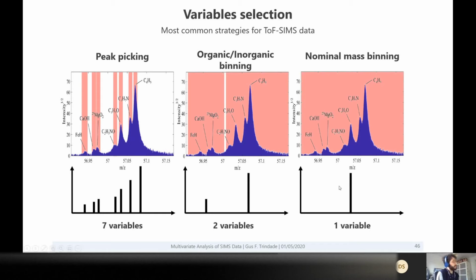So that's the danger. You have to consider sometimes, it's a simple system, and for unit mass, you only have a single peak. So you can do this. It's just a matter of knowing your data. And these are the most common strategies. There's a few others, there's some new ones in the literature nowadays, but these are the most common ones. In any case, what you end up with is a list of peaks, right? In this case here, 1 for each unit mass, and here several more for each unit mass.